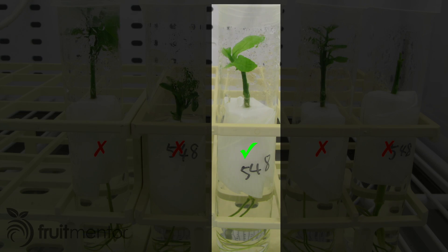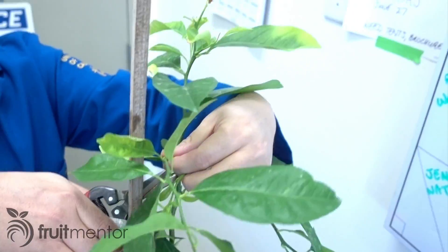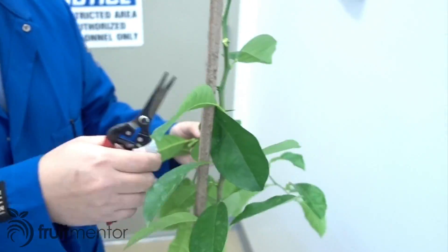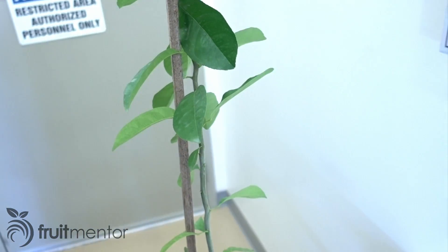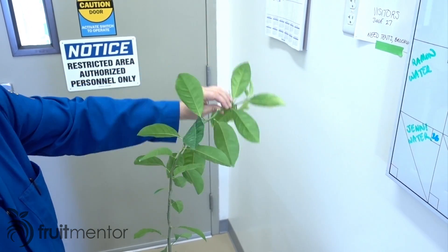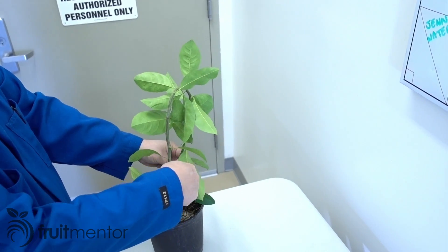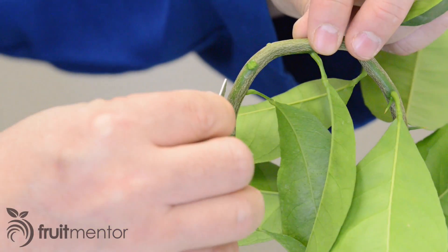Once the graft of the introduced variety is grown to a good size, it is propagated onto a bigger rootstock seedling. In order to produce fast growth, the rootstock typically used is rough lemon. First, the lemon seedling is bent over to overcome apical dominance, which would prevent further growth of the graft.